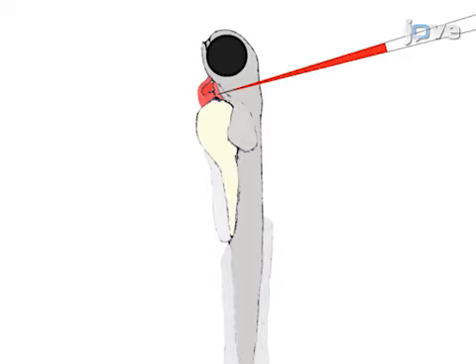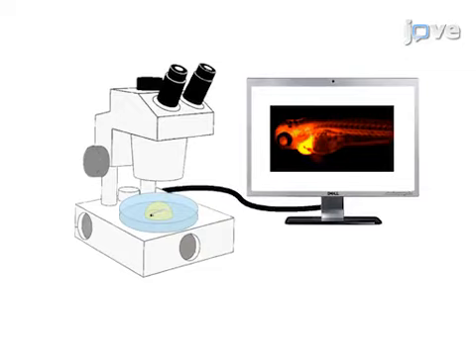Then the pericardial cavity is injected with a rhodamine dextran fluorescent dye and fluorescent images are acquired of the cardiac region using an epifluorescence dissecting microscope.